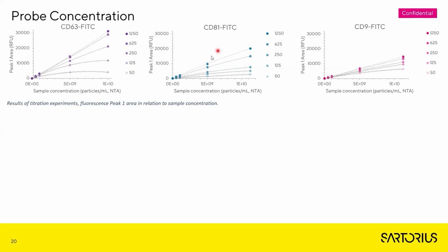However, it often occurs that with increasing concentration, the signal further increases even with very high probe excess. In such cases, a further increase in probe concentration would increase the sensitivity. However, it would also increase the cost and ecological footprint of the analysis.